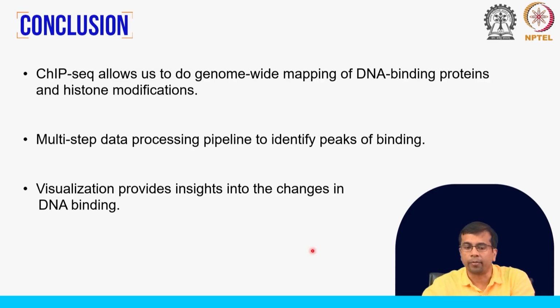And we will also do some visualization, because this is very powerful to give us insights into the changes in DNA binding or the histone modification patterns happening across different samples or across treatments, and we can see them visually, and we can then of course corroborate with the peaks that are identified by the software tools.